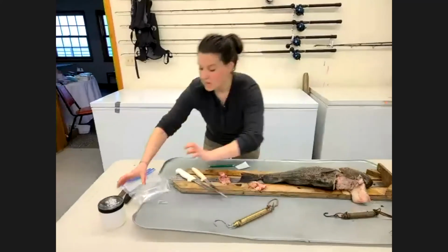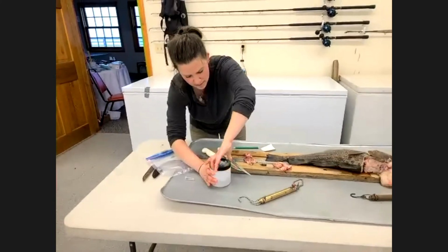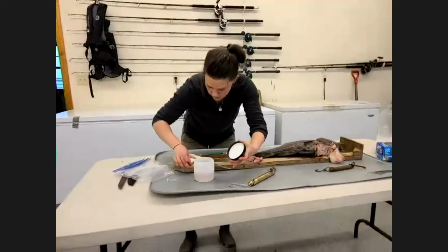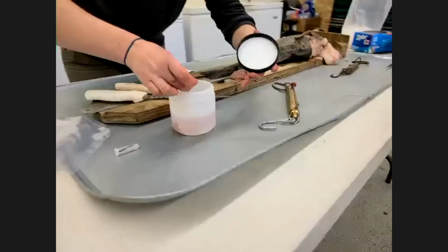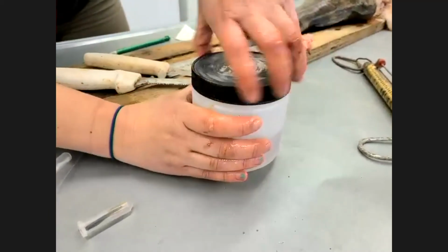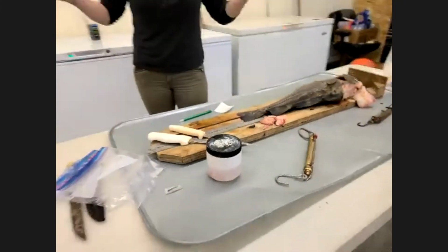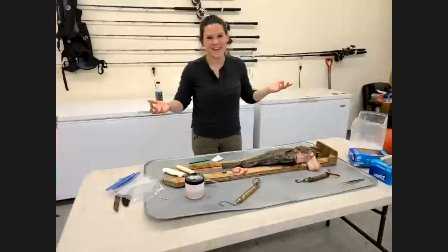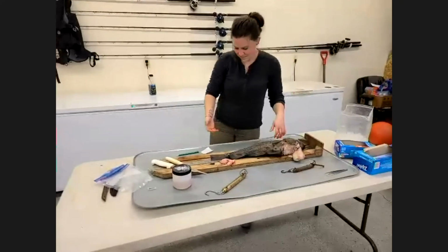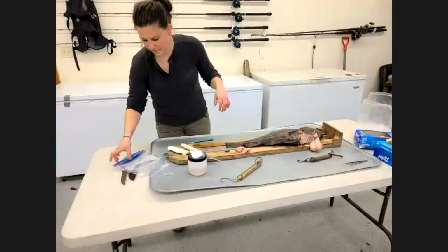So just so that I can pick through this later and make sure I didn't miss any little pieces in here, I'm going to put the stomach in an ethanol jar along with that otolith because I don't want to forget that. And there you have it. Those are samples that we take. Cool. So Robin and I are going to head back upstairs now and sit back down at the laptop, and we can take some questions.